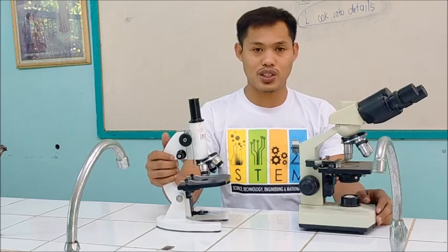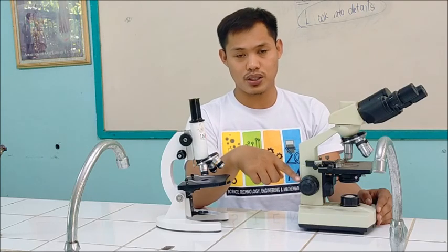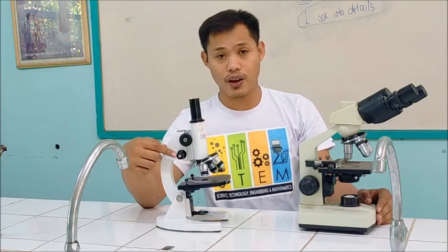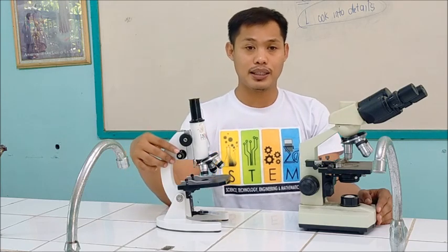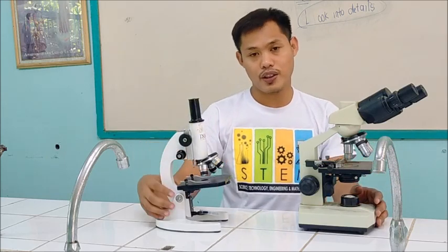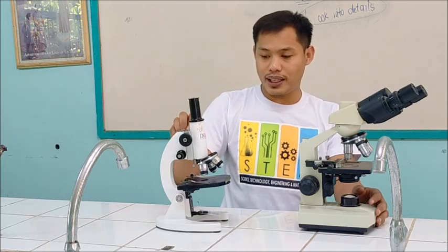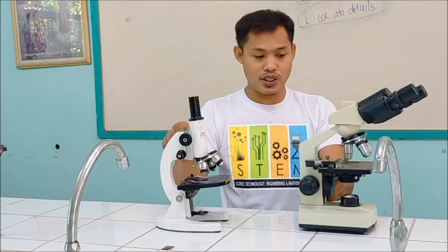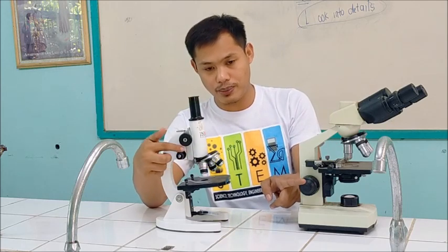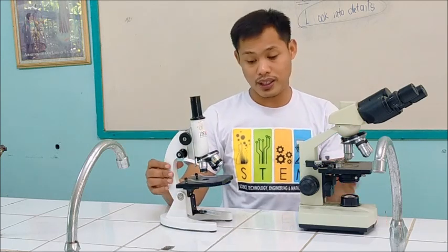The next one is the adjustment knob. We have two types of adjustment knob: the fine adjustment and the coarse adjustment. For the monocular here, this is the coarse adjustment and this is the fine adjustment. What is the function or purpose of the adjustment knob? It focuses the specimen, or gives a focused image of the specimen. The coarse adjustment moves up and down, and so does the binocular. The fine adjustment gives a finer view of the specimen or the image itself.